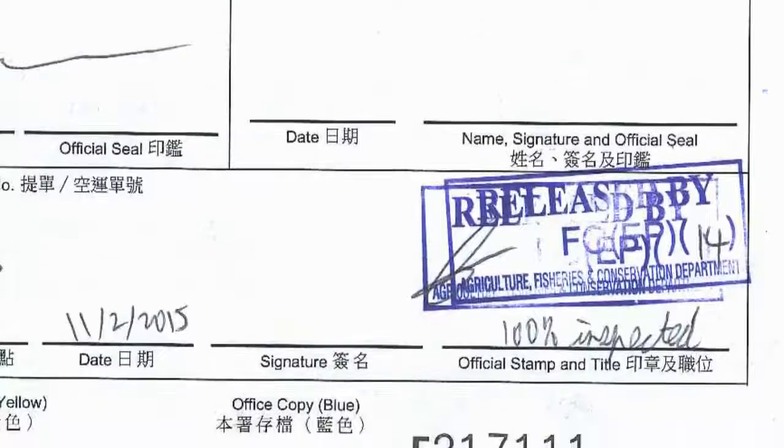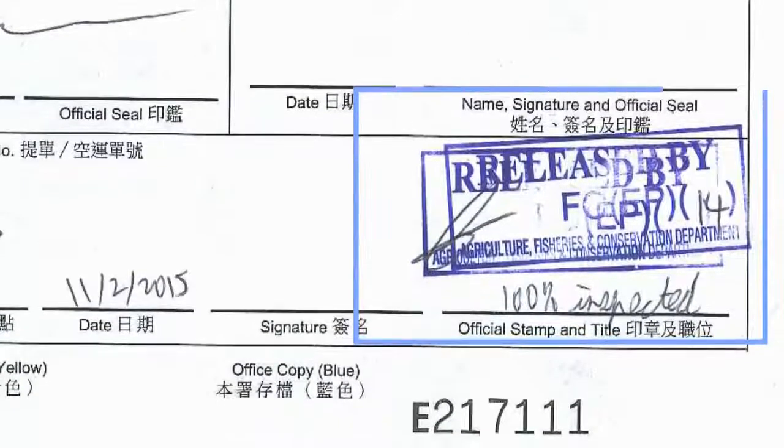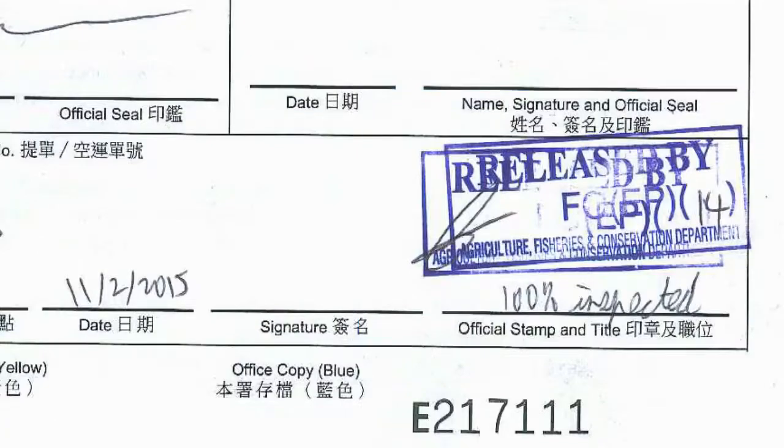Note: at the bottom of the CITES export permit, there's a box that must be stamped by customs just before the package is shipped. Otherwise, the permit is not considered valid and the samples could be confiscated by authorities before reaching the laboratory.